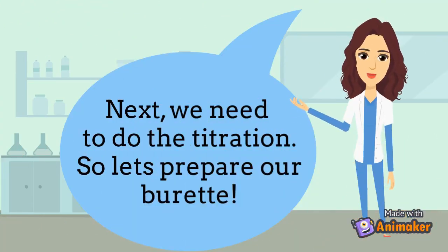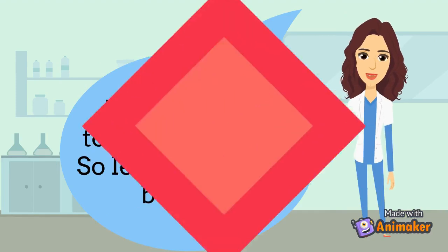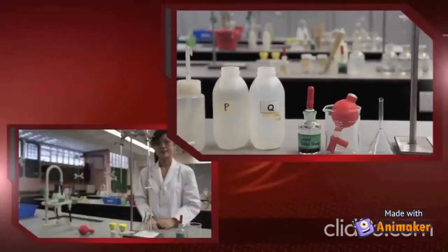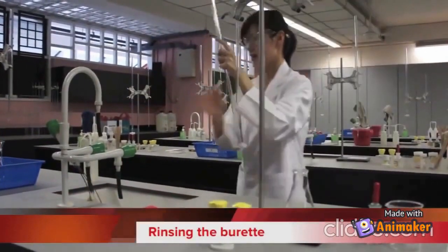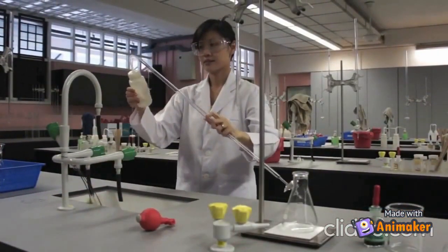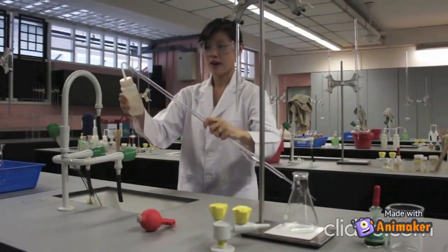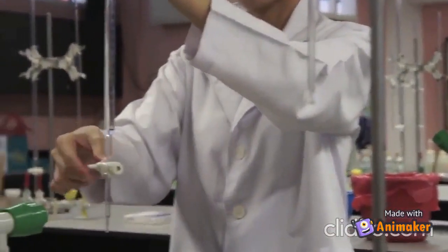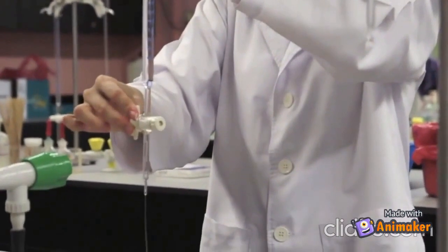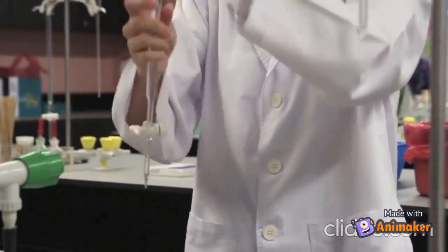Next, we need to do the titration. So let's prepare our burette. The first step is to start by rinsing the burette. Use distilled water to wash the inside of the burette. Release the water from the bottom of the burette so that we wash the tip as well. Pour the rest of the water out from the top of the burette.